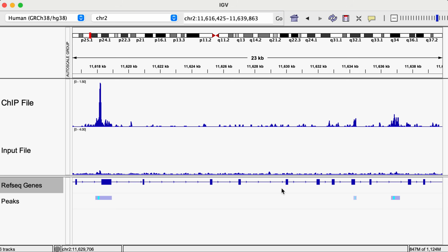Now, if you're seeing a lot of potential false positives or false negatives, it's worth going back and rerunning MACS, adjusting some of those parameters and fine-tuning it to more closely fit the particulars of your data. And again, remember to visit that MACS webpage to learn more about that fine-tuning process and what other parameters you can use. Now, these peak calls are going to be the basis of our analysis going forward, so it's really crucial that they're of high quality. And of course, in class, we're going to go over a little bit more specifically how to perform some QC checks on these calls, and then also how we're going to be able to use them for things like motif discovery or tying them to target genes.